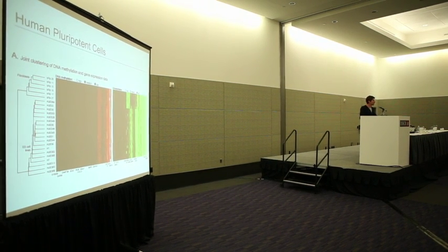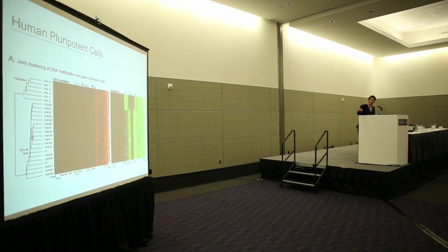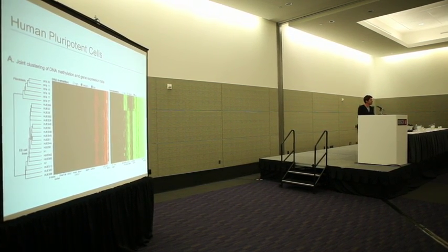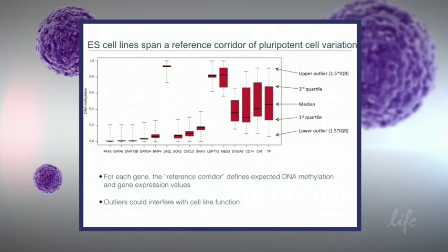And so what I'll do in the next slide is just take these 15 genes, which give you a spread from left to right for low to high levels of DNA methylation, and then show you in a box plot the differences for these 15 genes across the 20 different cell lines. And this is what's shown here. There are a couple of interesting things you can immediately see from this. You can see that there are some genes here on the left side, and the legend is shown here, but basically there are some genes in the genome where, if you profile DNA methylation across all 20 cell lines, you see very little, almost no variation across these.